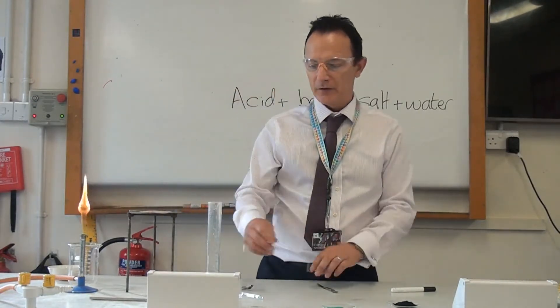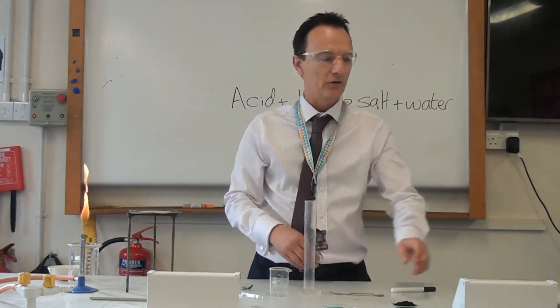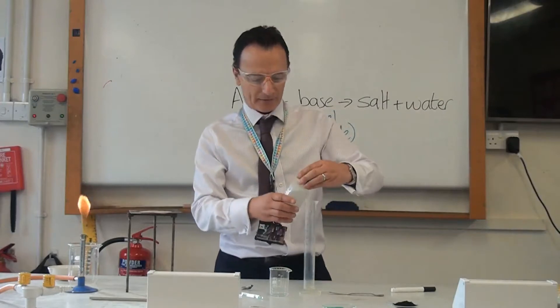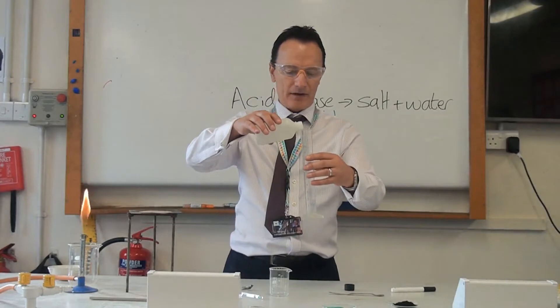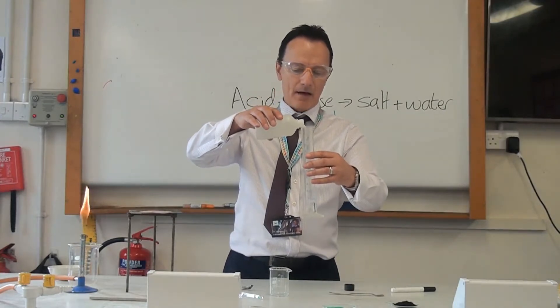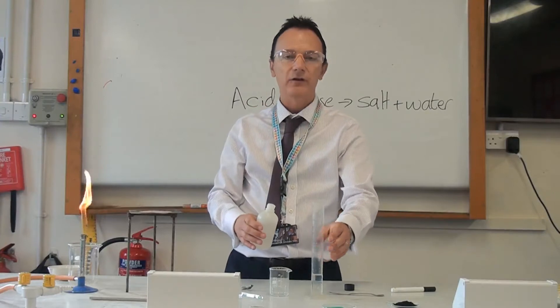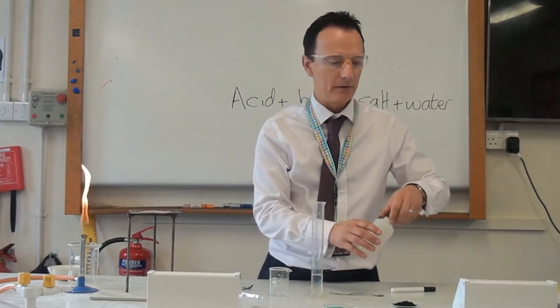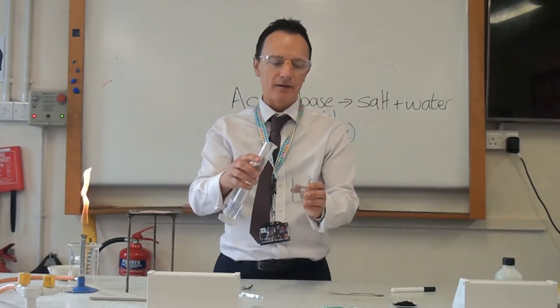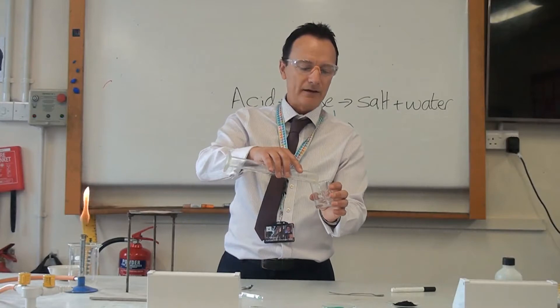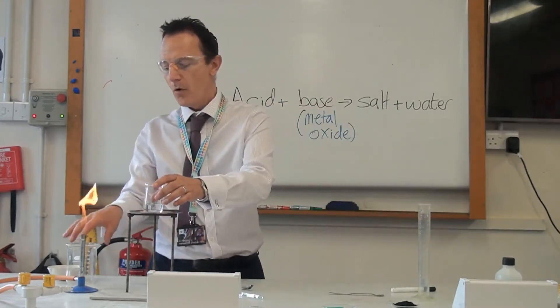The first thing we need to do is measure out the acid. We are going to measure out 25cm³ of hydrochloric acid using a measuring cylinder. If you get asked to describe a method in the exam, make sure you are saying exactly what measurements you are using and describing what equipment you are going to use to measure it. We have measured 25cm³ of the acid and we are going to place that into a small beaker so that we can warm up the acid.